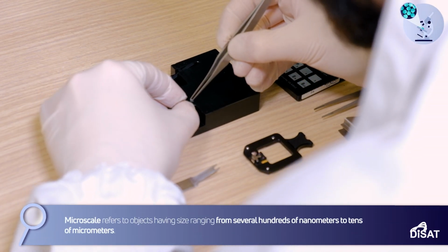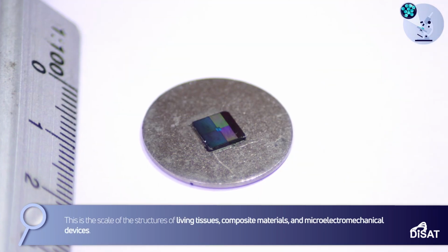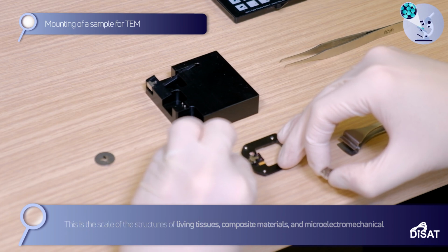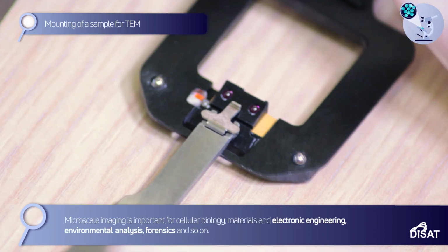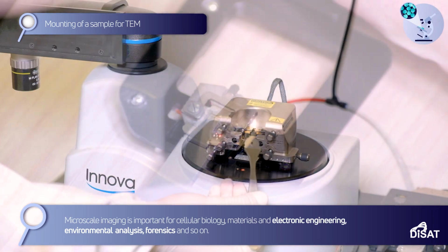Microscale refers to objects having size ranging from several hundreds of nanometers to tens of micrometers. This is the scale of the structures of living tissues, composite materials, and microelectromechanical devices. Microscale imaging is important for cellular biology, materials and electronic engineering, environmental analysis, forensics, and so on.